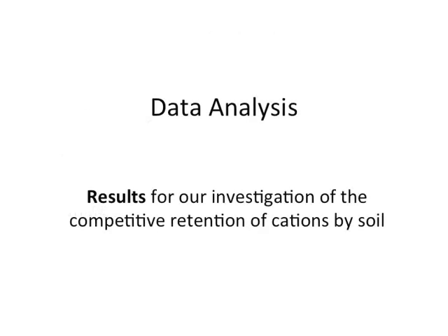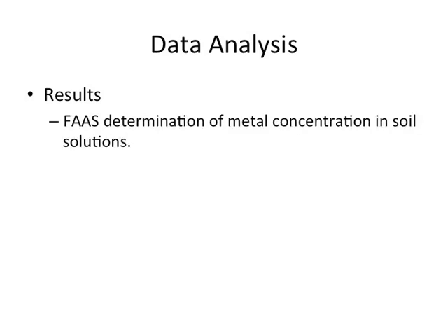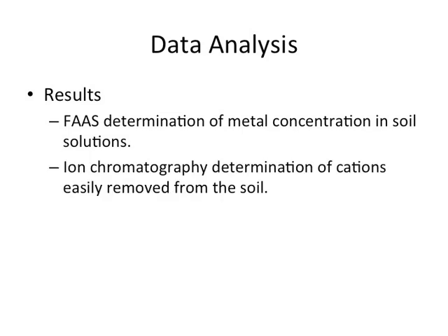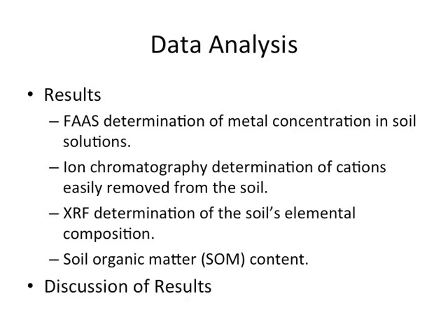In Reel 3, you will begin your data analysis by compiling your results. These include your flame atomic absorption results, the ion chromatography results, the XRF results, and the soil organic matter results. With this information, you can move on to the discussion.